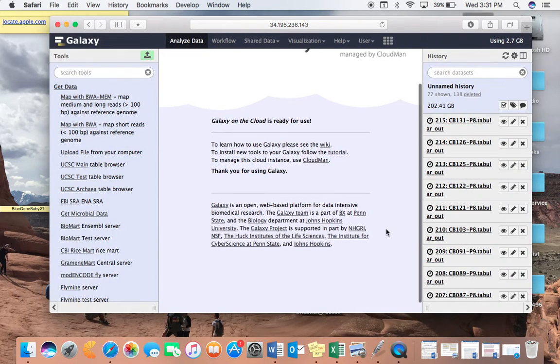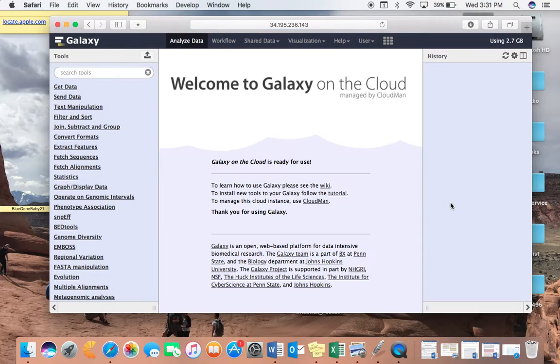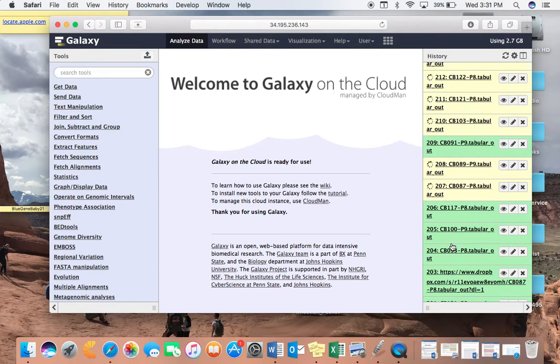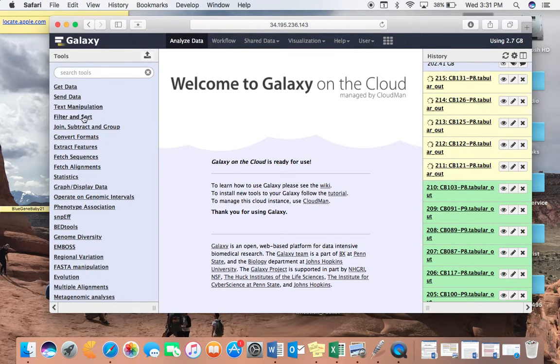Okay, so now we should have our files. They may still be running. It shouldn't take too terribly long. Again, you can see them turning green. If you get to this point in the video, you can just fast forward until they all turn green, but it looks like they're going pretty quick.